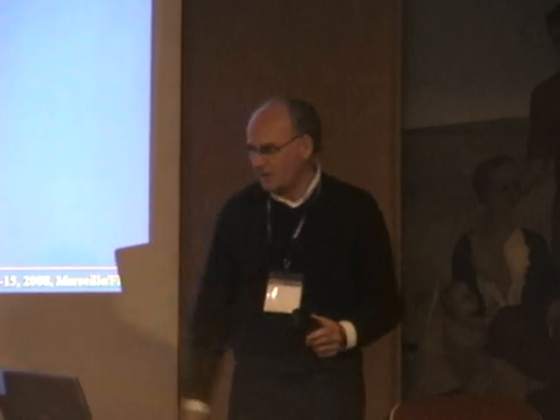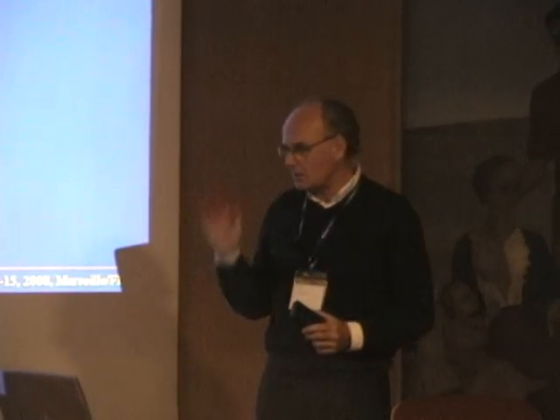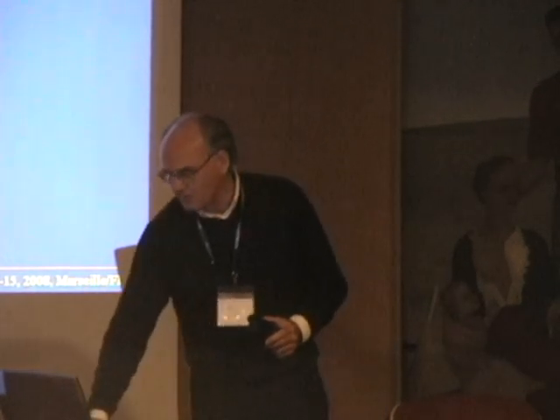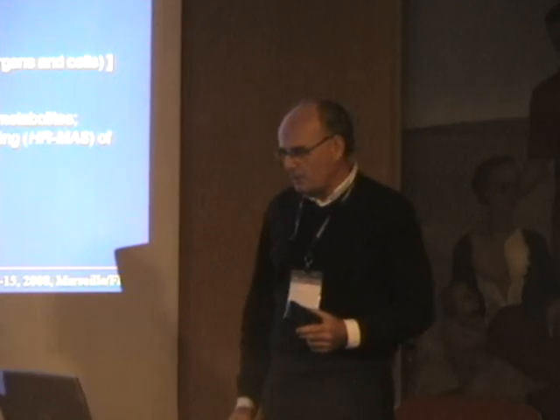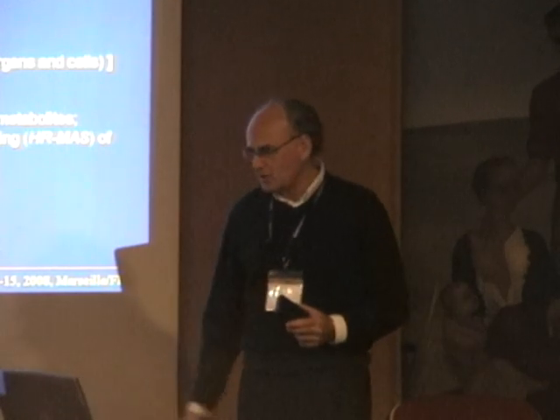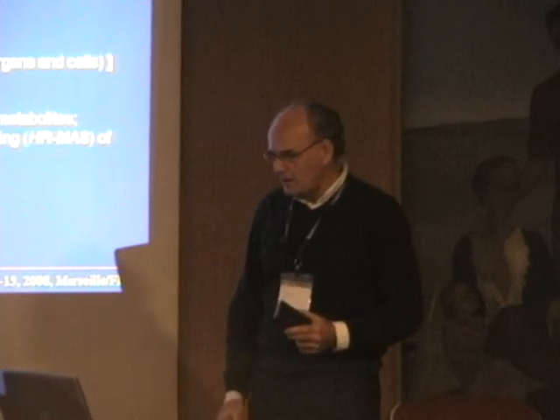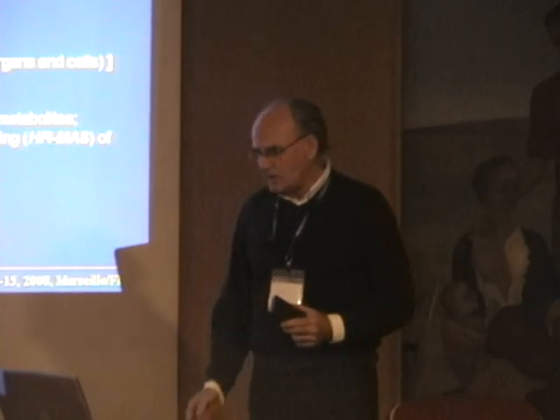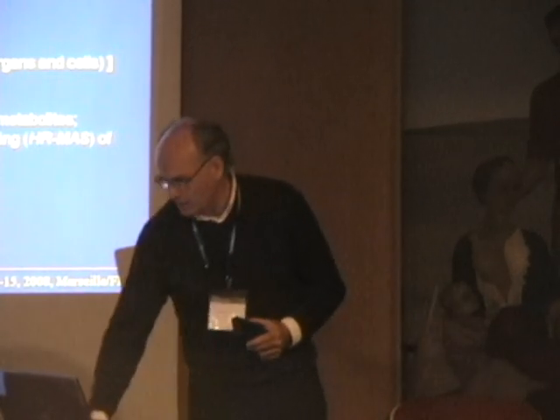Or a scientific rationale may be you want to exclude effects of anesthesia, so there are perhaps specific scientific projects where you have to absolutely exclude anesthesia, so you cannot do in vivo experiments, so you have to take a biopsy. But the most important and interesting rationale is number 4, a methodological rationale, namely in vitro you can dramatically increase the spectral resolution in your spectrum. That means you can identify and quantitate a lot more metabolites than in vivo. This is particularly true for tissue extracts where you generate solutions, and to a somewhat lesser extent this is true for high resolution magic angle spinning where you don't extract your tissue samples.